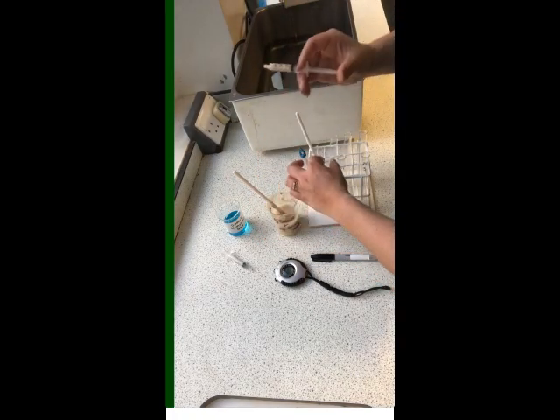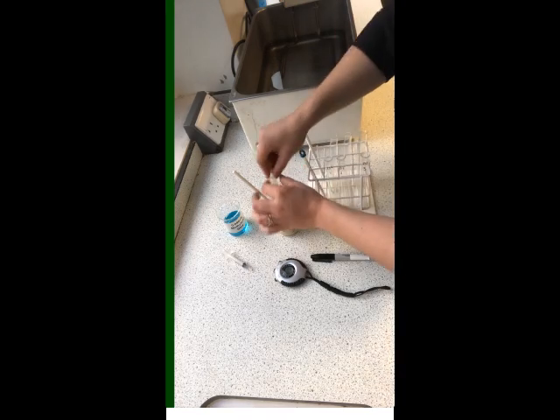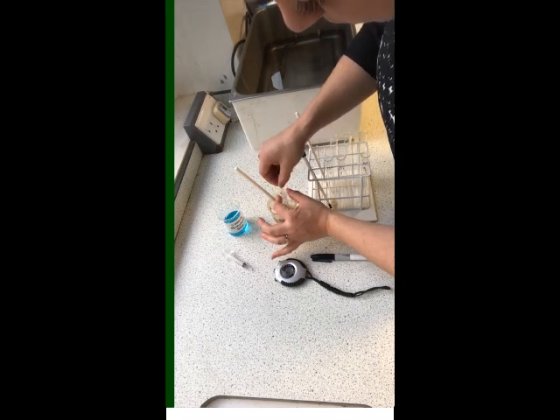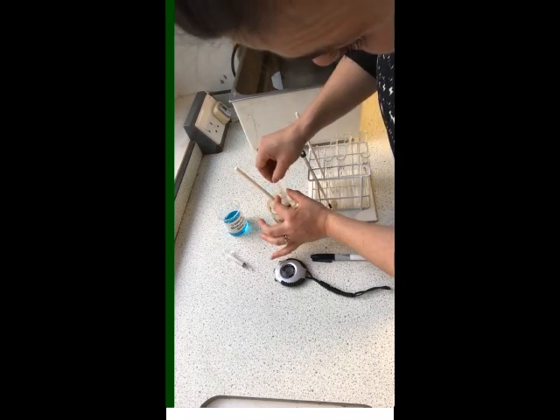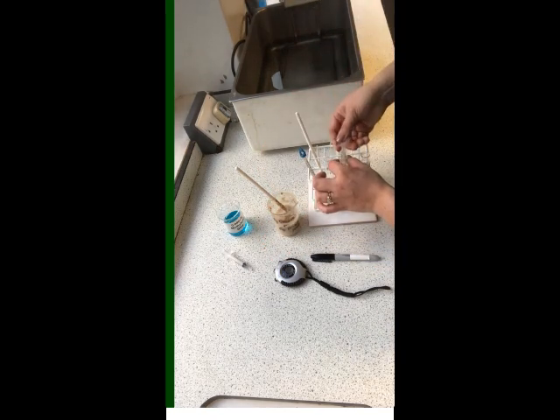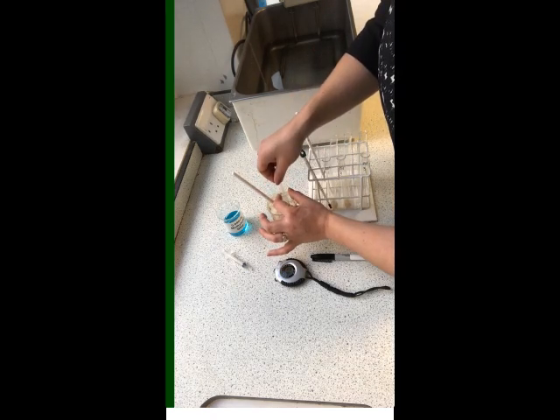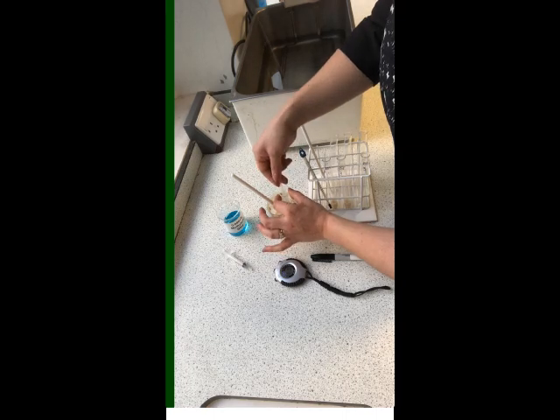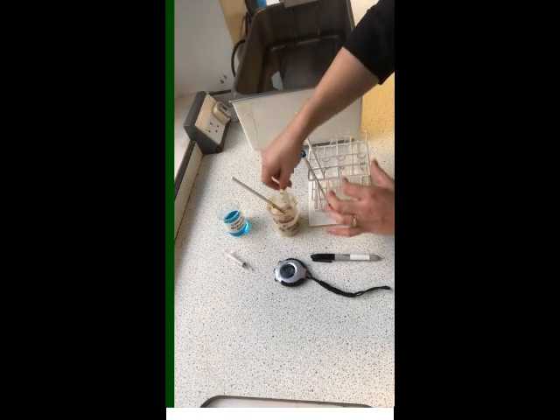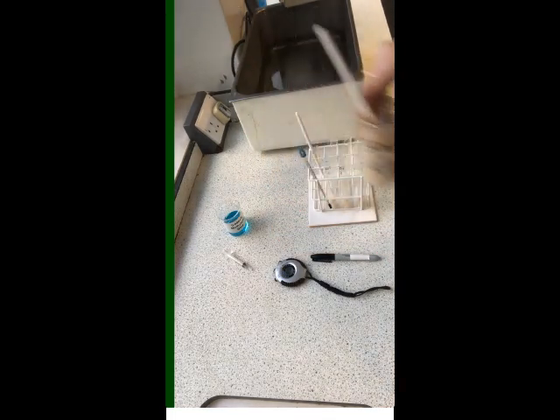Okay, and place that into our tube. Okay, and remember, we're not going to cross-contaminate any of our syringes in this practical. So fresh ones for each different substance that we use. Okay, now I'm going to pop this back in the incubator so that it doesn't cool down too much for our next round.